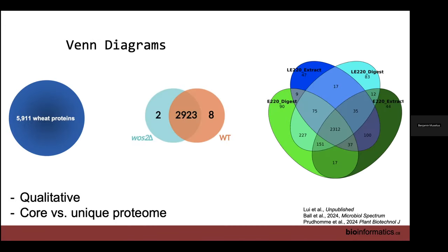I start off very basic here, and this also feeds back into the concept of how and where you are presenting your data. If you're doing more of a biological presentation or a biological publication, then the way you present your data may be more intuitive to a biologist than perhaps volcano plots or t-SNE plots. They look amazing, but a biologist may look at them and say okay, not because they don't appreciate it or know how to interpret it, but because it's not how they would typically see data presented in publications.